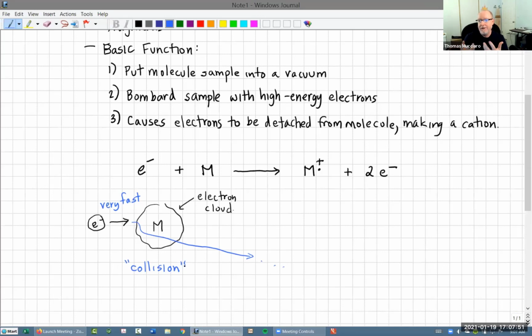Electrons are like clouds. And the collision that we talk about is just that because they have the same charge, they repel each other. So it's an issue of you're shooting this charge at another charge, and they repel each other. So they get close. It's like, how close can you get them before the repulsion stops them and then pushes them apart, if that makes sense.